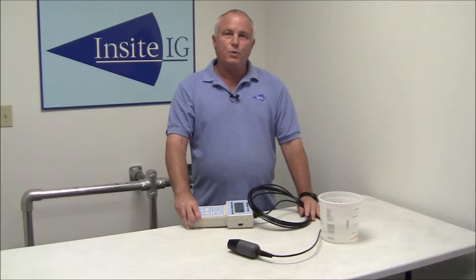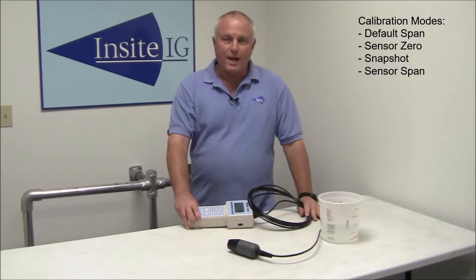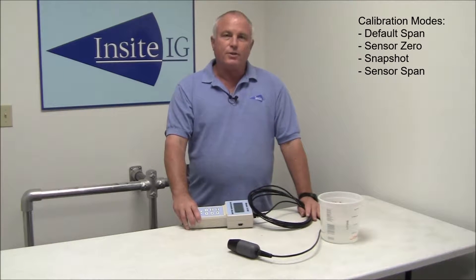There are four modes of calibration. There's a standard default that we load here at the factory. You can return to that at any time if your calibration gets way off. Then there's a zero calibration, what we call a snapshot, and then a sensor span.